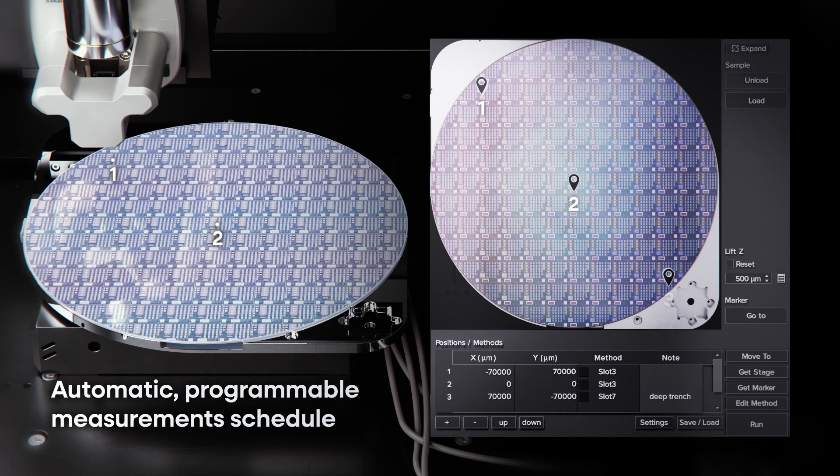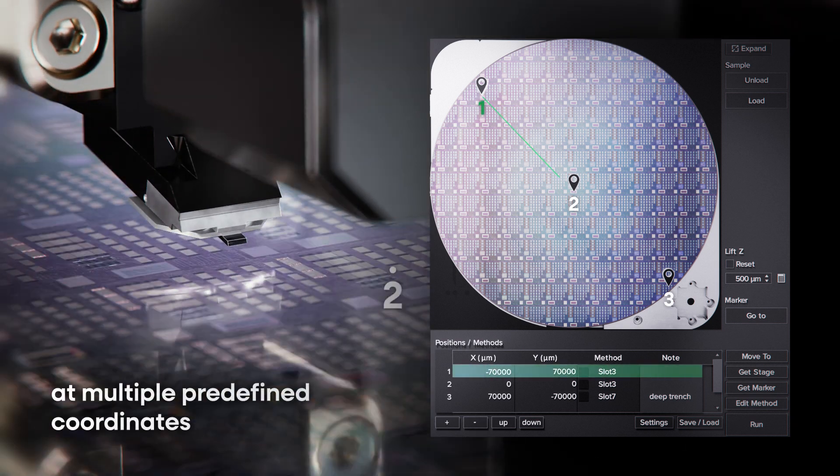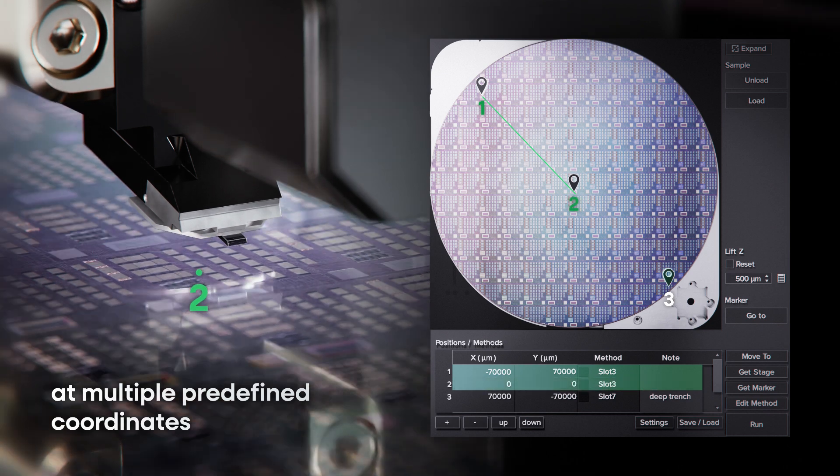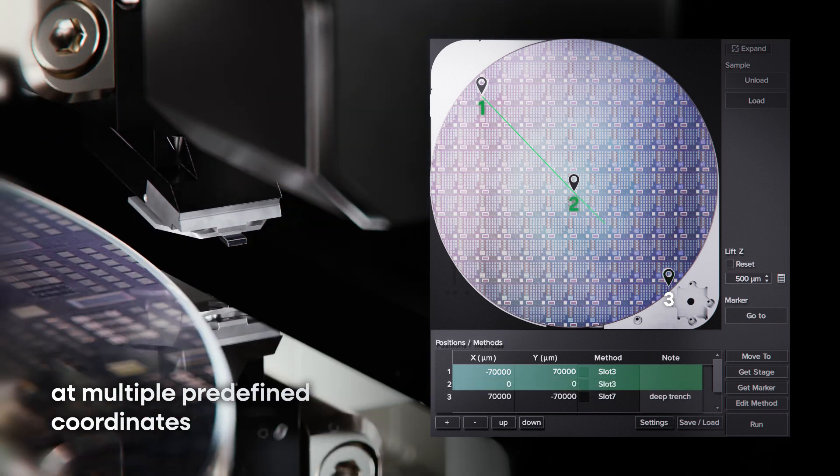StepScan, one of our productivity software features, automates and programs measurements, enabling multiple scans at predefined coordinates and advanced modes like conductive AFM, EFM, and more.